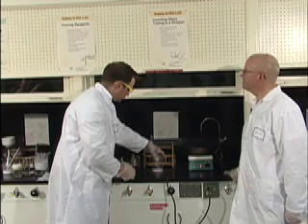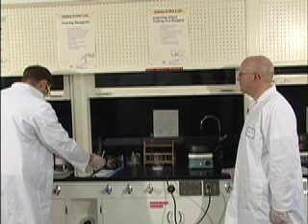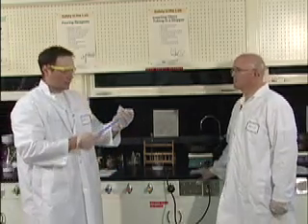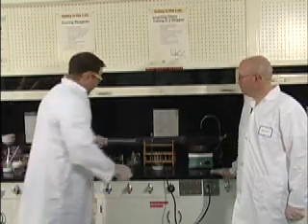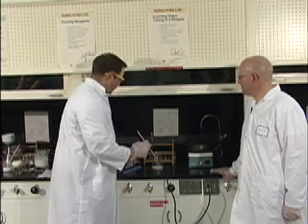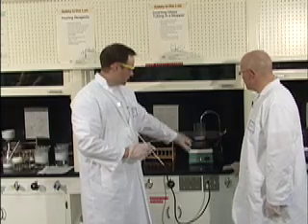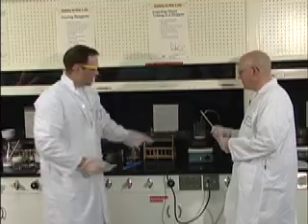Now we've got to mix that up. So what we're going to do is take a thermometer. You have a thermometer in your drawer. Take a thermometer and we're going to place this on a steam bath. The steam bath is this copper pot that we have in the fume hood. And Jeff is going to stir that for us for a couple minutes with the thermometer until it reaches about 80 degrees Celsius.